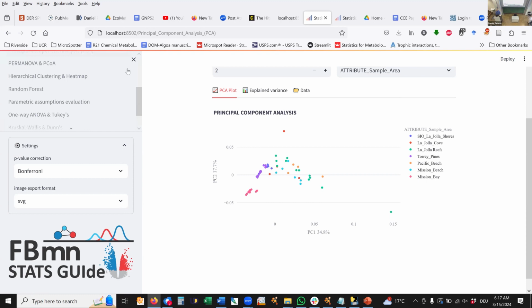To basically use this tree generation and explanation of distinction of the different sample areas by removing individual features out of the equation and then assigning mean decreased accuracies, so importance, to each of those features in explaining this difference, right? So that would basically provide you a long list with all the features ranked by that importance or mean decreased accuracy score that you now have as a table.